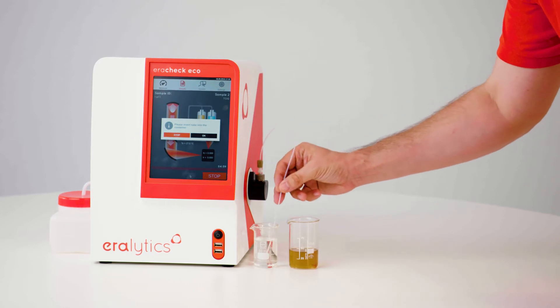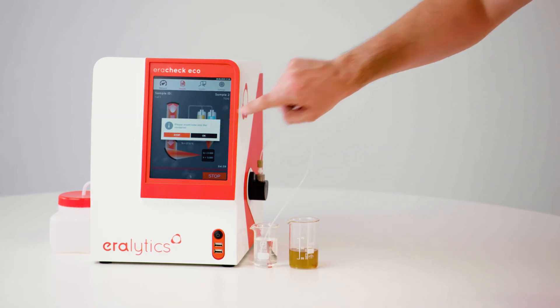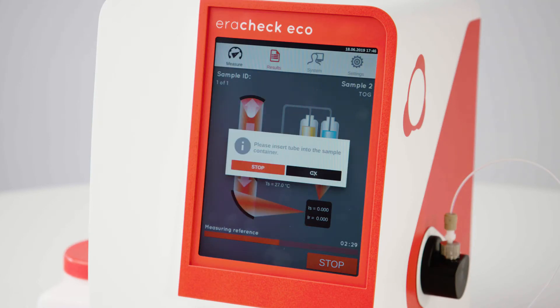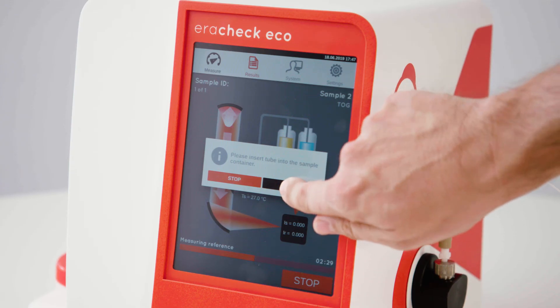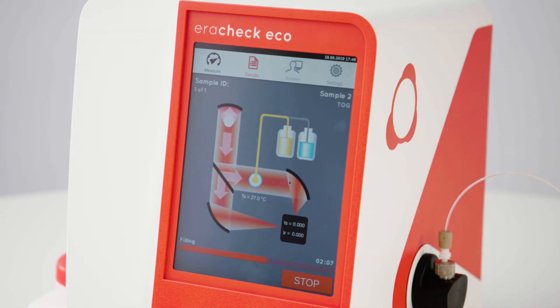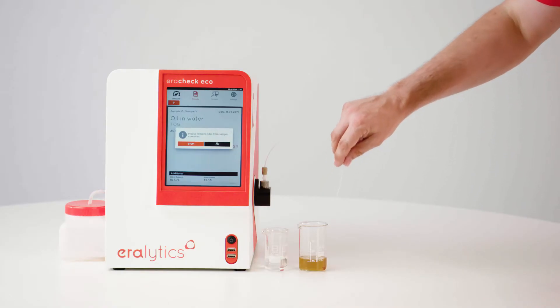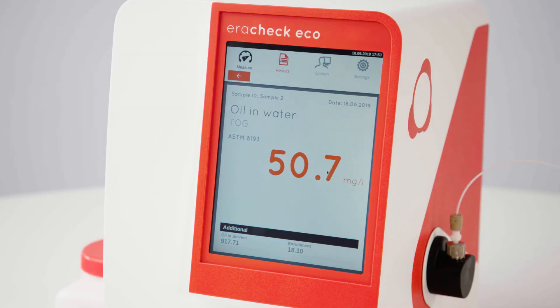Place the inlet tube in the solvent container and start the reference measurement by pressing OK. Switch the tube to the sample container and press OK to proceed with the sample measurement. The measurement takes a few minutes. After the measurement is completed, the detailed results screen is shown.